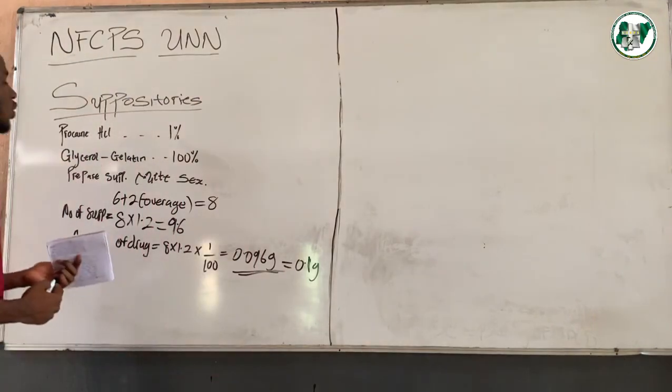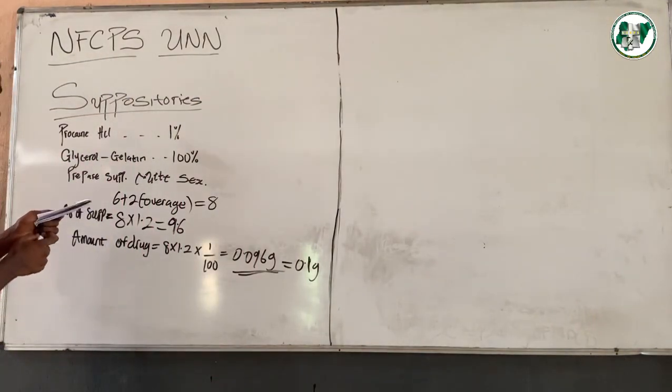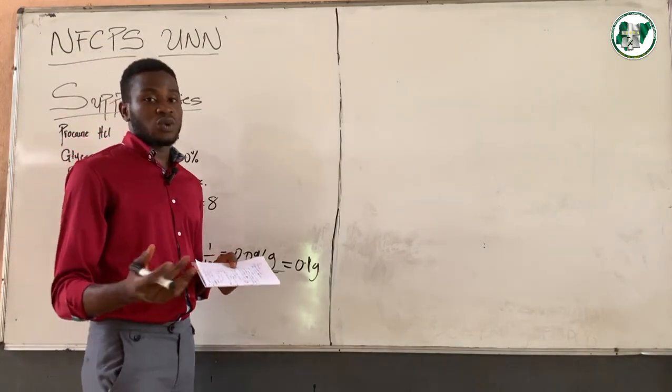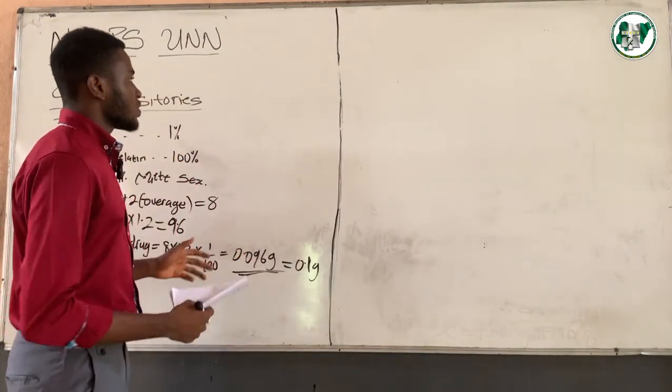Now, to get the weight of our base, what we are going to be using, we're going to use a formula which is quite different from the one we use when we're preparing using a fatty soluble base.